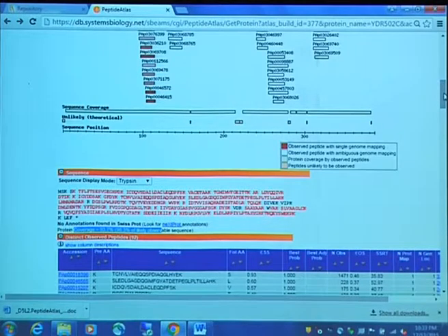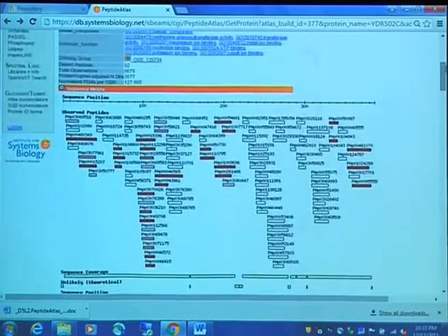So underneath the set of peptides, so this peptide view shows you the peptides. Yes? Absolutely, absolutely. Yes. So actually when PeptideAtlas was first built, it was very trypsin-centric. But we have changed the designation to be number of enzymatic termini. Most of our builds are purely tryptic, but we do have some builds that are mixed, and in that case we adjust this percentage.